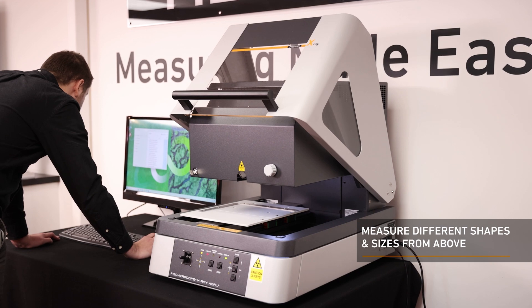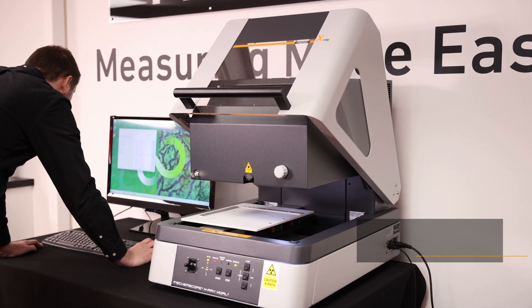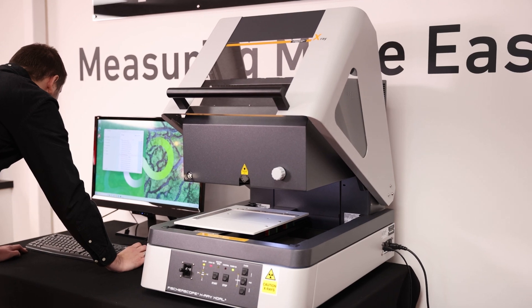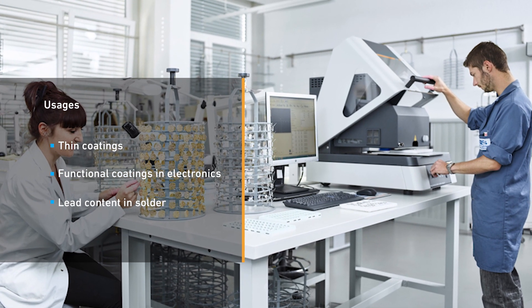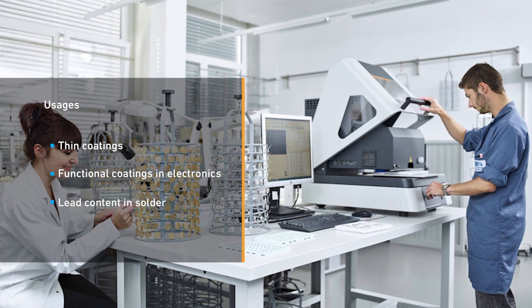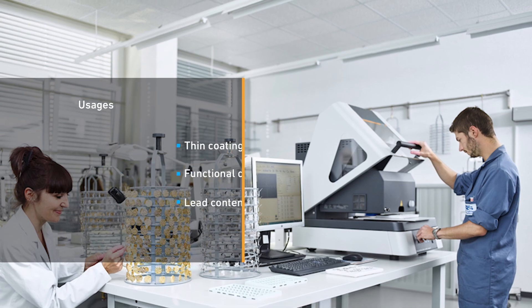The instrument has an X-Ray beam in a top-down measuring direction, so samples are measured from above. Typical fields of application include the analysis of very thin coatings, functional coatings in electronics, complex multi-coating systems, and determination of hazardous materials in RoHS screening.